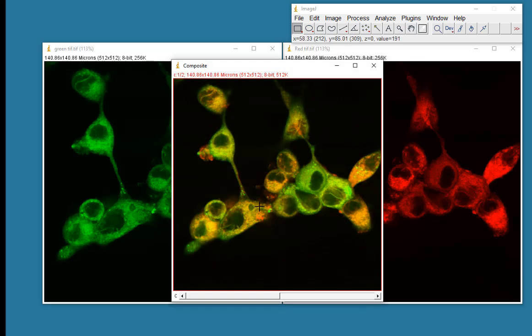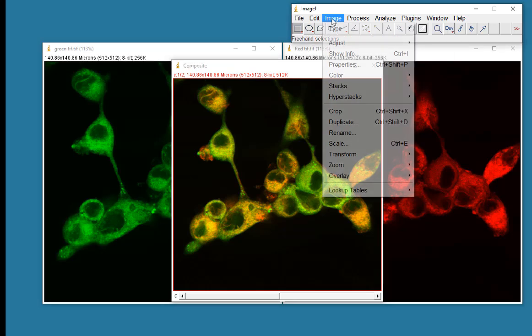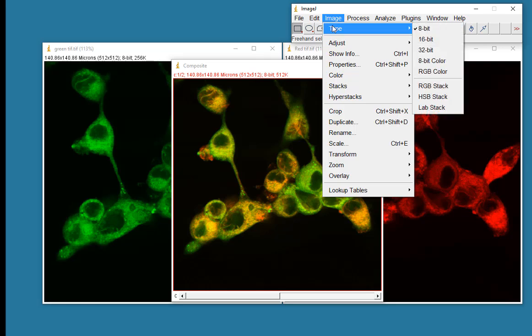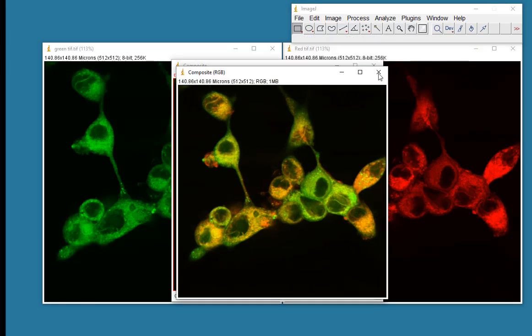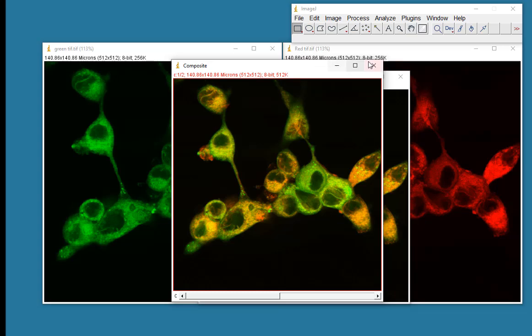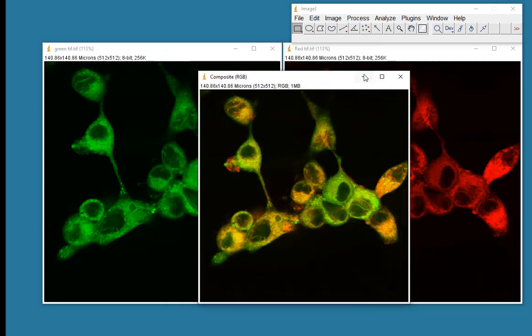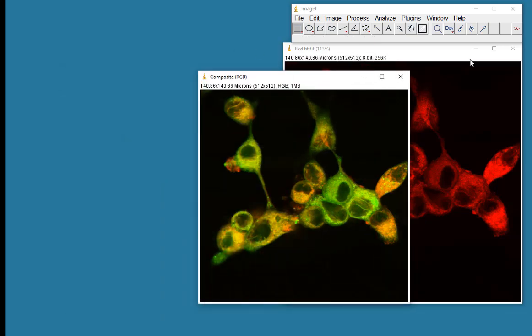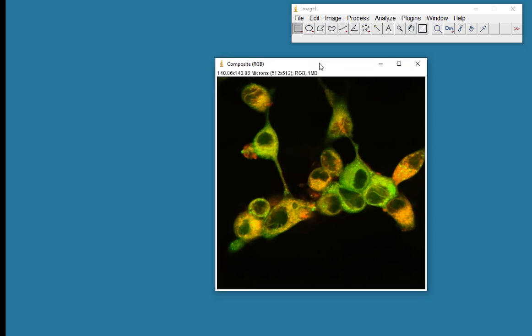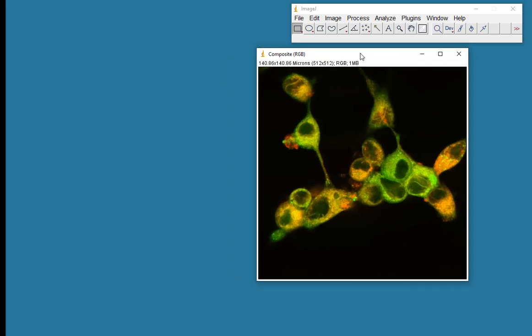Now in order to do a color threshold, I need to make this an RGB type image. So I'll go to Image, Type, and make it RGB color. I can get rid of this image here. In fact, I'll minimize these two images so that we're just working with our color image.